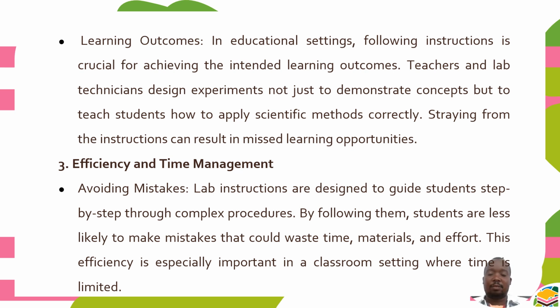So the idea is for you to learn. The idea is for you to have hands-on experience. The idea is for you to test the hypothesis. So if, let's say, you have injured yourself by not strictly following the safety rules, you may end up straying from the instructions, and this can lead to missed learning opportunities.